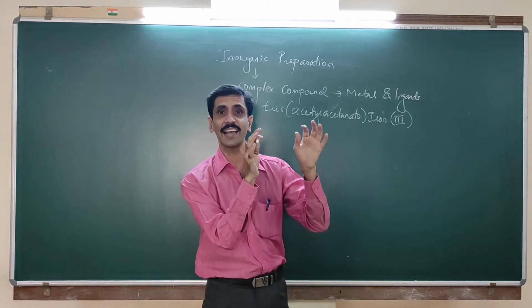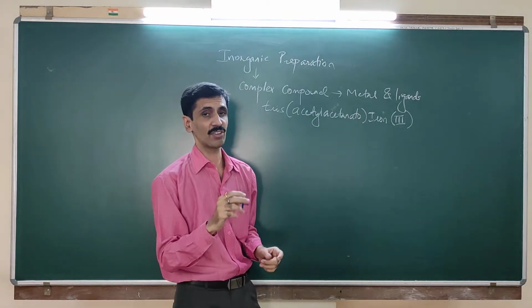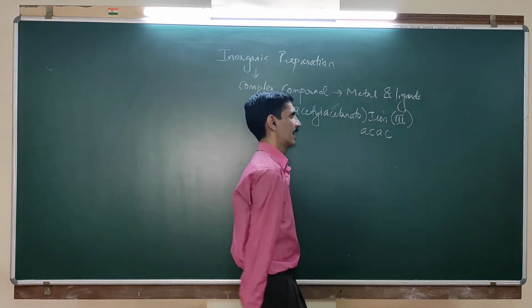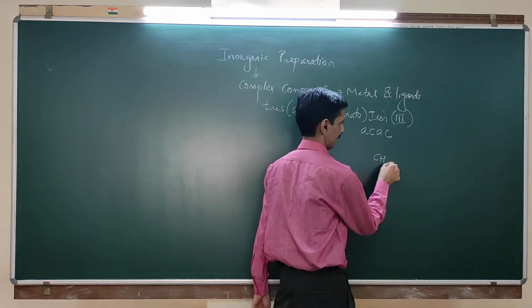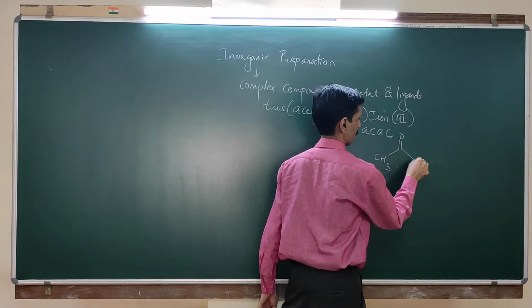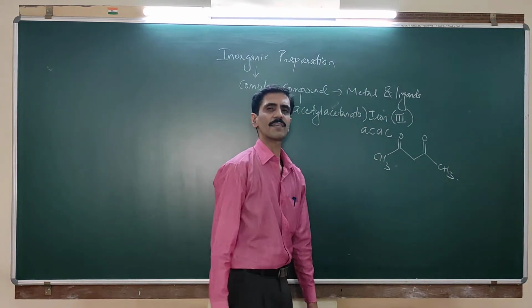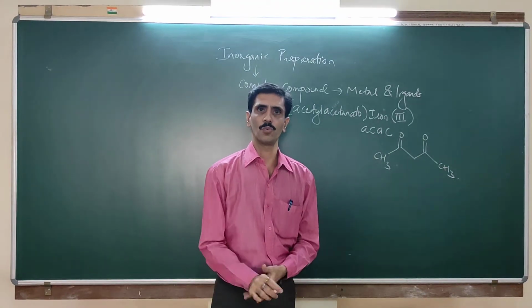The acetylacetone is a ligand. Okay? Now I'll just give you the structural formula of acetylacetone. We also call it, in short, ACAC, acetylacetone, and it is given as this. This is, my dear friends, the structural formula of acetylacetone.